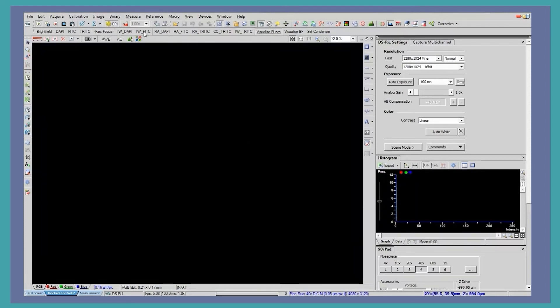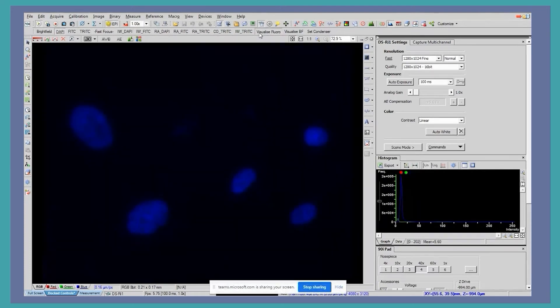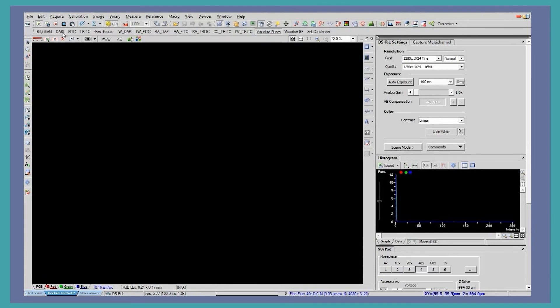There are many buttons and different features to note, but today we'll just focus on some of the more basic features. This button here highlights that we can get the live image from our microscope onto the screen. Additionally, there are different channels we can look at such as DAPI for blue, FITC for green, and TRITC for red.